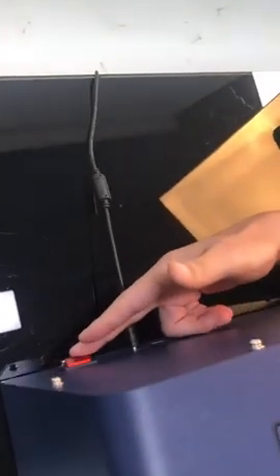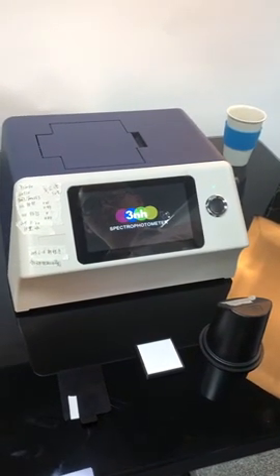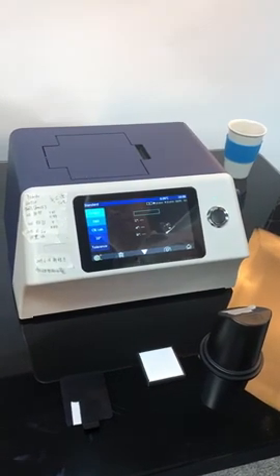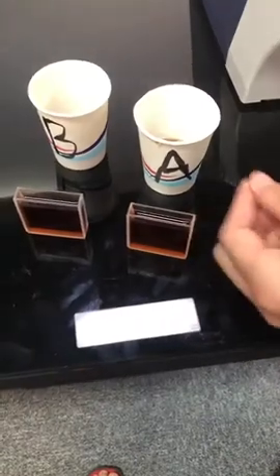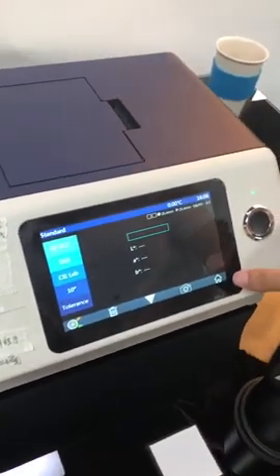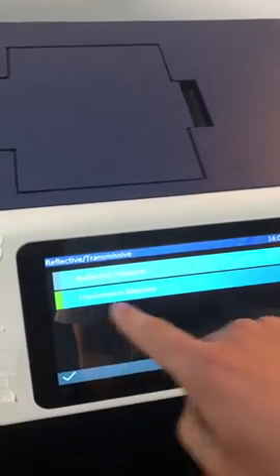Switch it up — the power switch here. It is starting. Because the liquid samples here are kind of transparent, so we need to use the transmittance measurement mode to measure the color. First, we adjust it to transmissive measurement mode — the second one. Confirm.